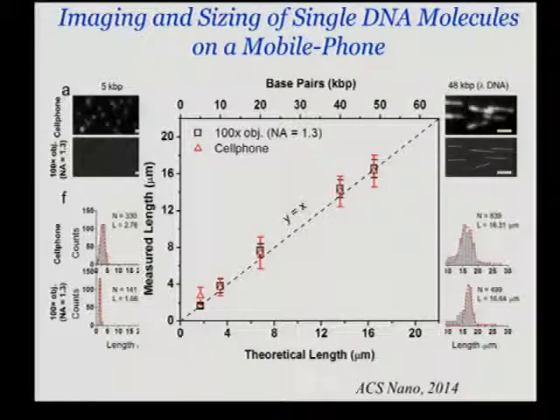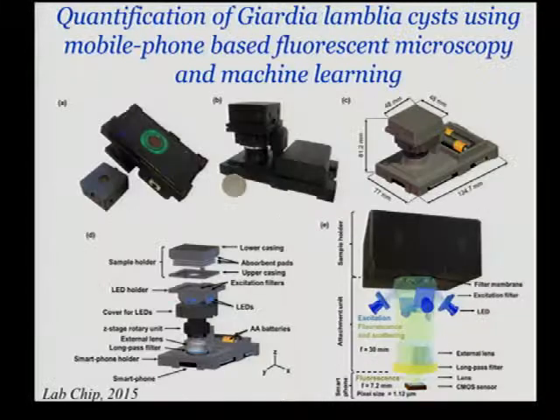And some applications that we're currently pursuing is actually to understand drug resistance by labeling certain genes and then trying to understand the copy number variations. Let's say you have malaria from your blood. We can understand if the species that infect you has a certain gene more replicated in the backbone, more than, let's say, 3, 4, which would mean that we need to change the drug to another drug for handling the drug resistance issues. So this combination with machine learning and server backend processing can be applied to many different things.